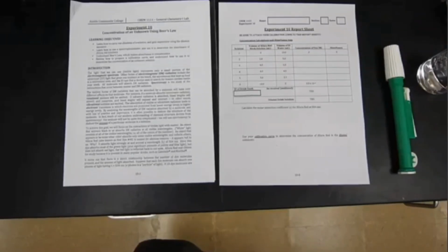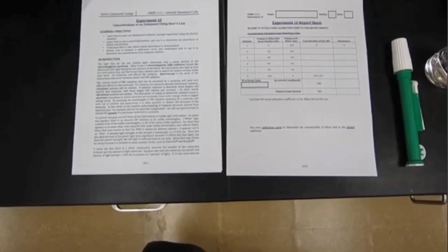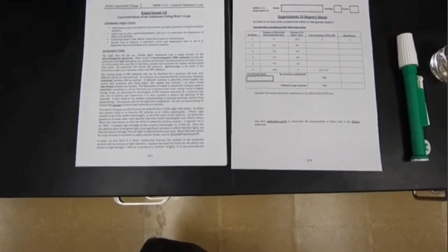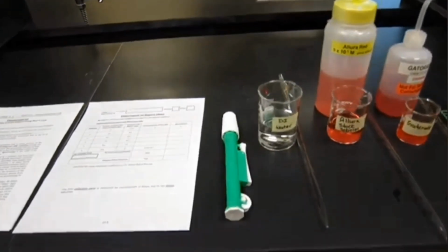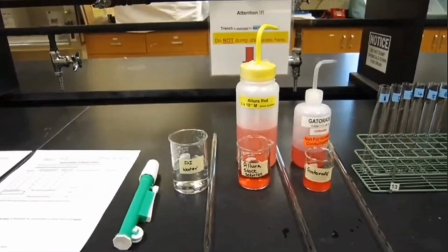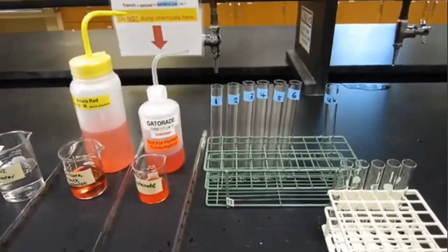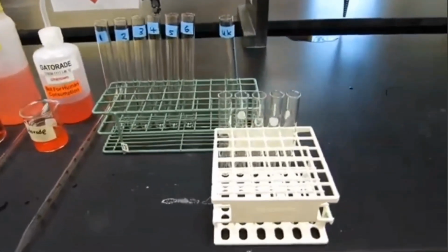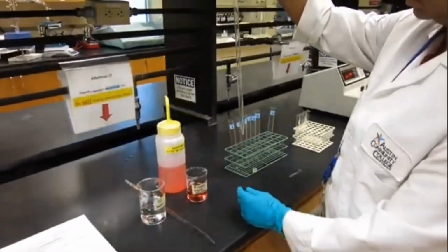Hello everyone, this is going to be our experiment 10, which is the concentration of an unknown using Beer's law. So in this experiment, you will learn how to carry out dilutions of a solution and gain experience using the dilution equation. Learn how to use a spectrophotometer and use it to determine the absorbance of an Allura red solution. Understand Beer's law, which relates absorbance to concentration. And review how to prepare a calibration curve and understand how to use it to determine the concentration of an unknown solution.